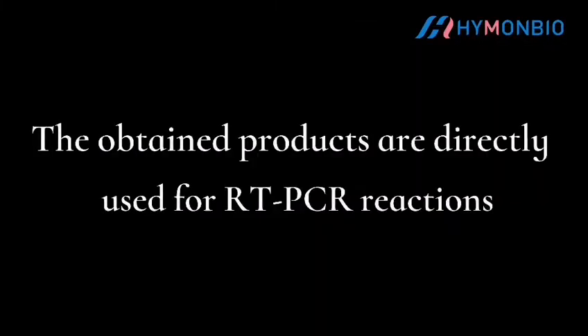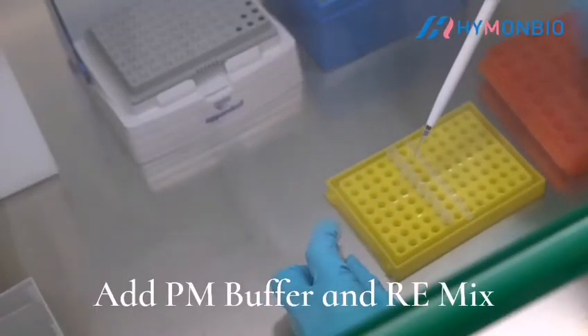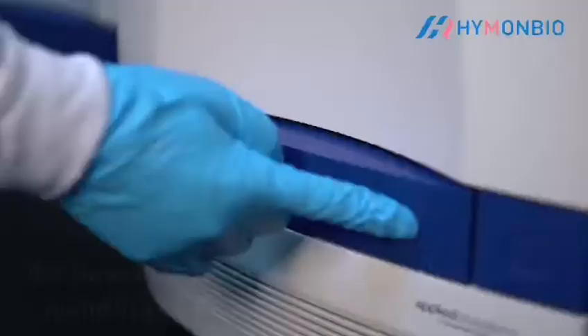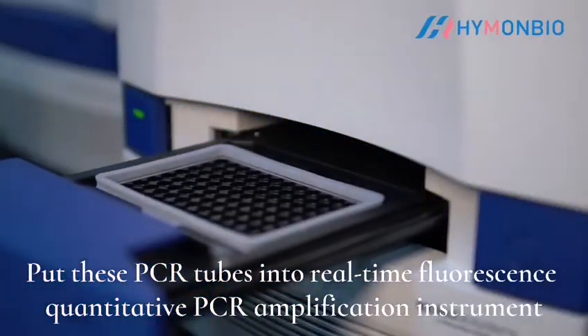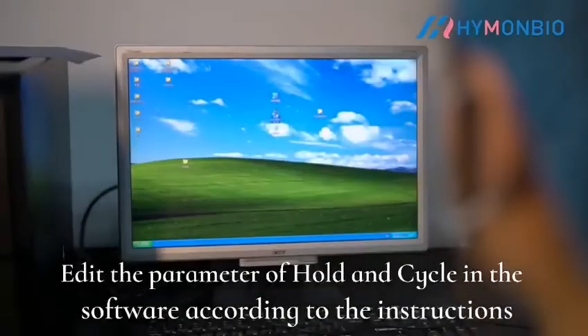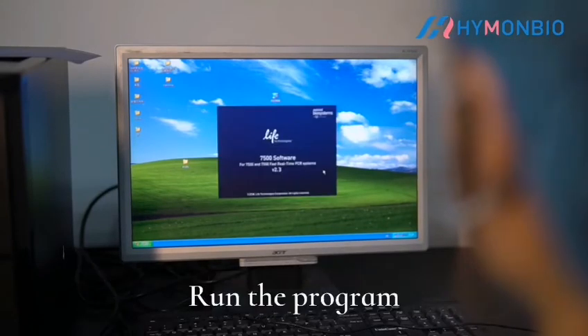The resulting products are directly used for RT-PCR reactions. Add PN buffer and REMix, then add the processed sample. Put the PCR tubes into a real-time fluorescent quantitative PCR amplification instrument. Edit the hold and cycle parameters in the software according to the instructions, then run the program.